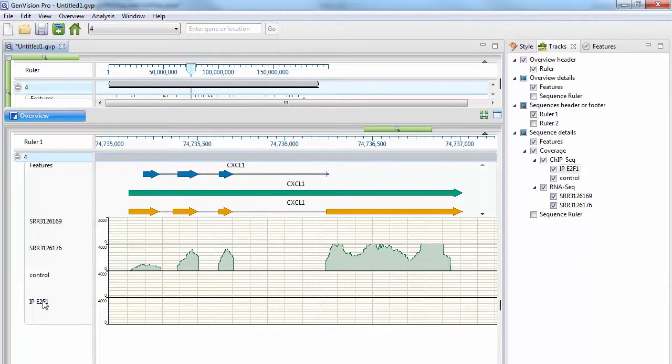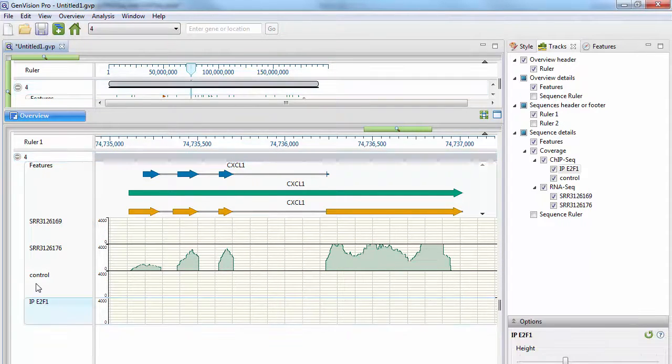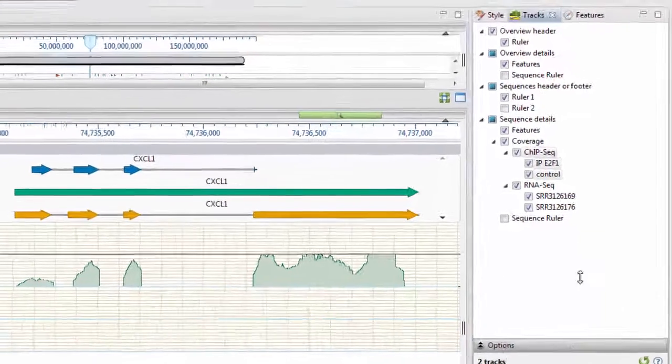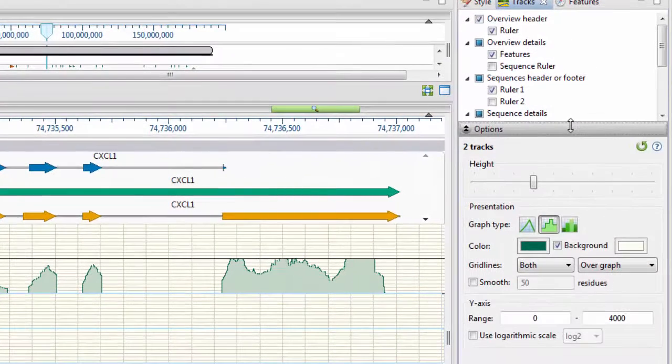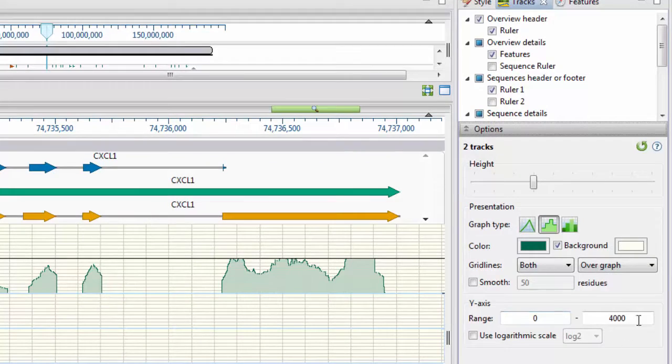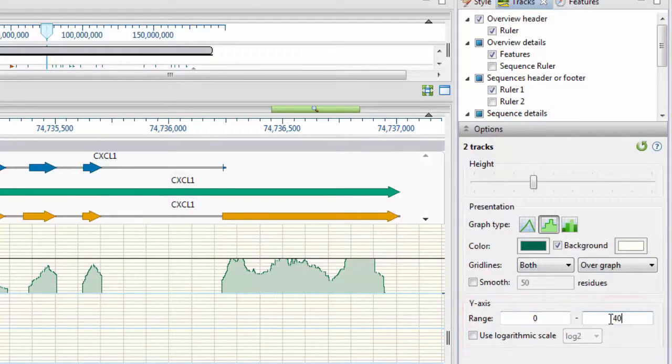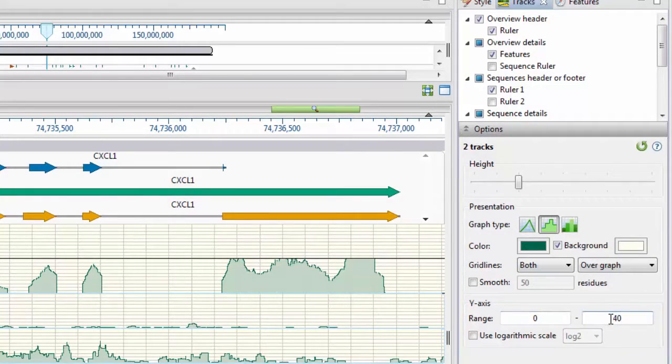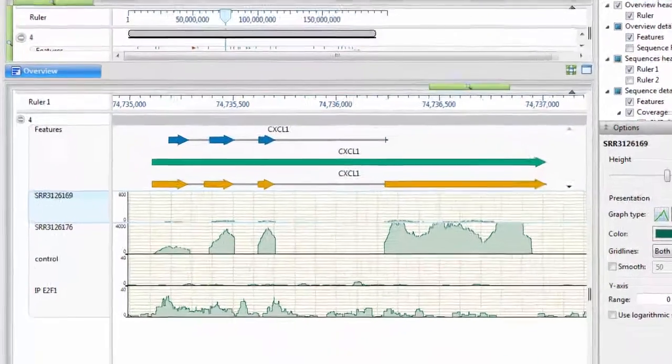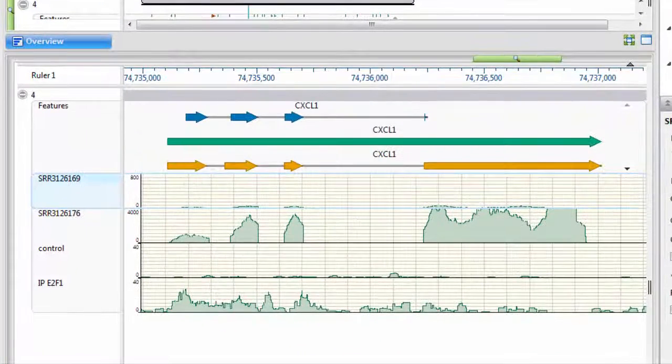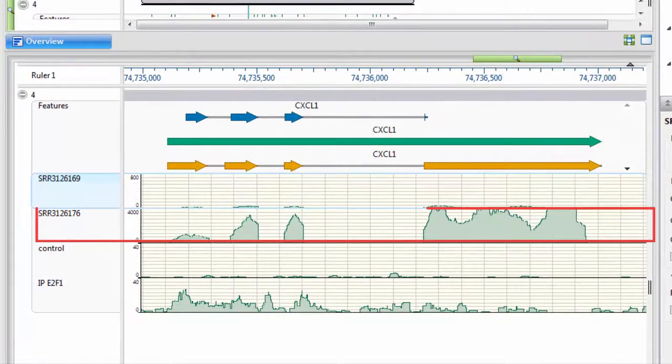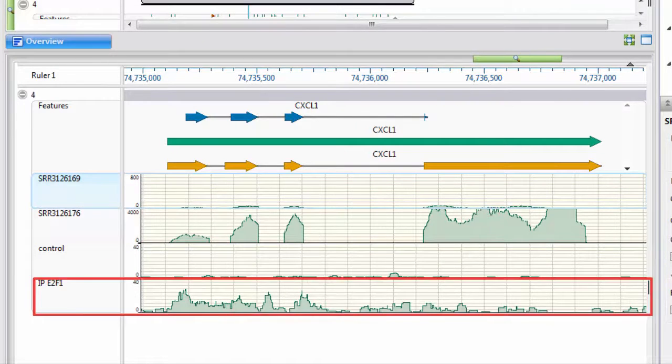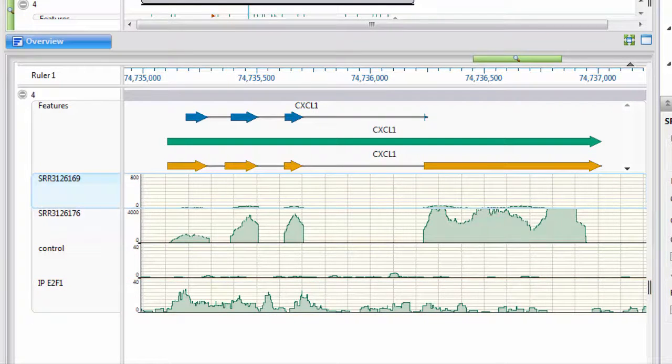I can do that by selecting the data tracks and then changing the Y-axis range from the Options panel. And now I can see the upregulation in gene expression for this time point, as well as the high IP signal values for the ChipSeq experiment for this gene.